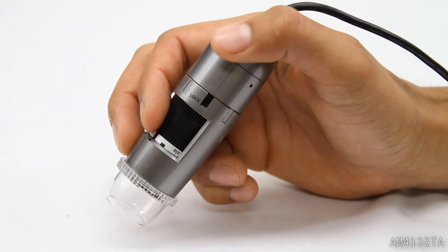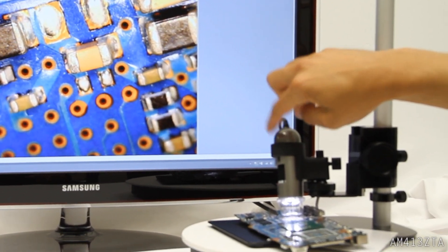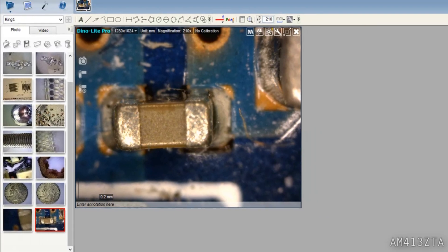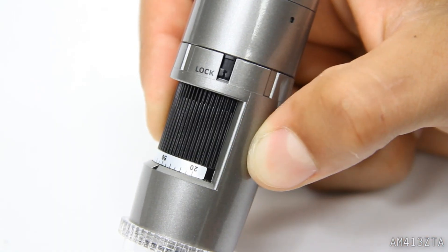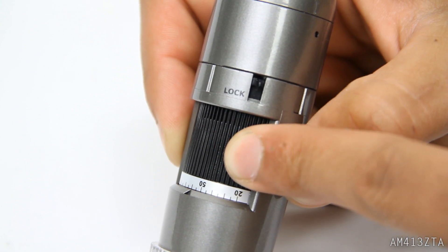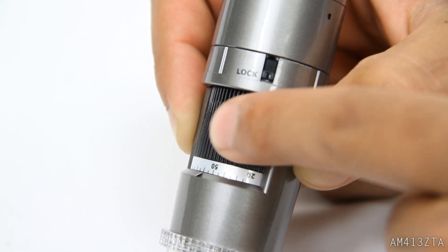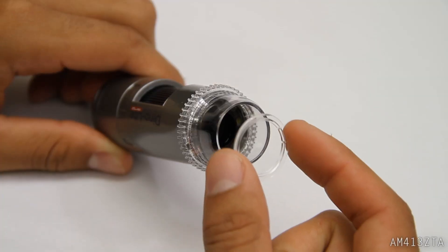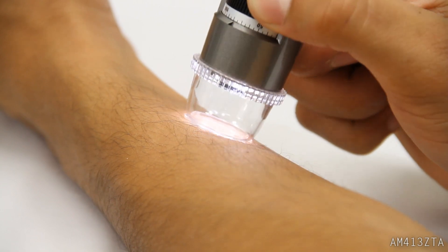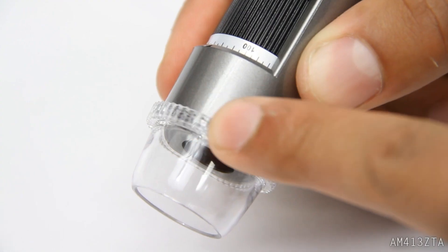Use the microtouch trigger to easily capture images without the mouse or keyboard. Use the scroll lock to secure your desired magnification. Use the lens cap to protect the camera from dust and debris. Adjust the polarizer by simply turning the nozzle for the desired effect.